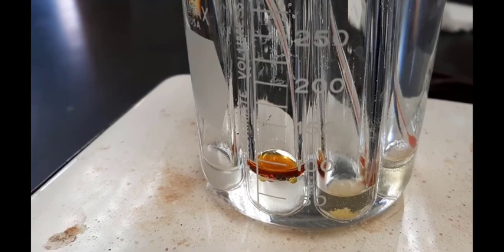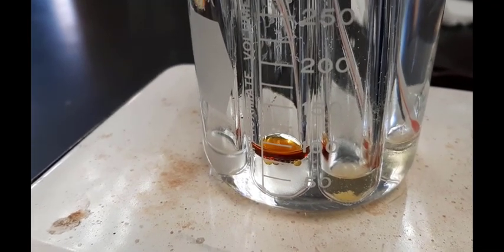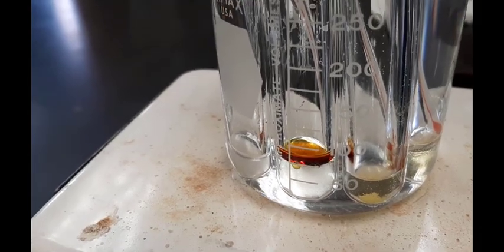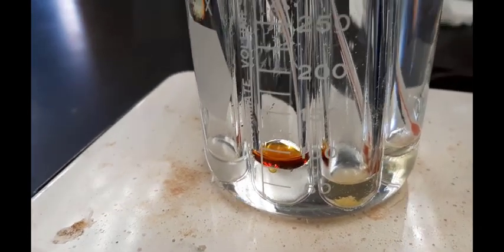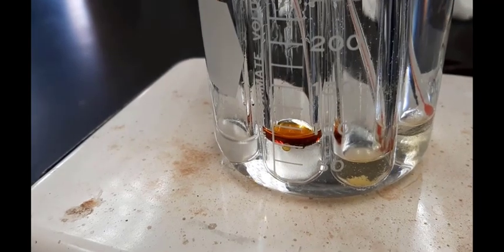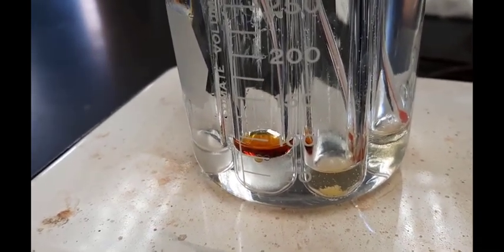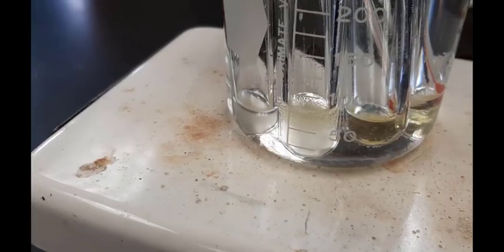Here you see the 4 solutions. On the left is propanal. Next, to the right of it, is the benzaldehyde solution. Then we see the acetone with a clear yellow precipitate in the bottom of it. And then furthest to the right is the cyclohexanone.